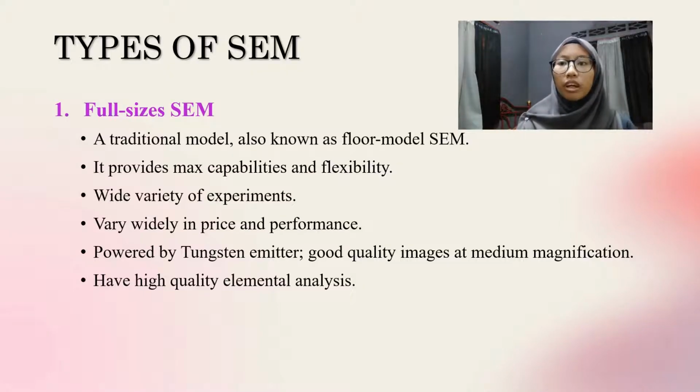Next, we have types of SEM, which is scanning electron microscope. First, we have full size SEM. It is a traditional model, which means one of the oldest, one of the starters, also known as floor model SEM. It provides max capabilities and flexibility.